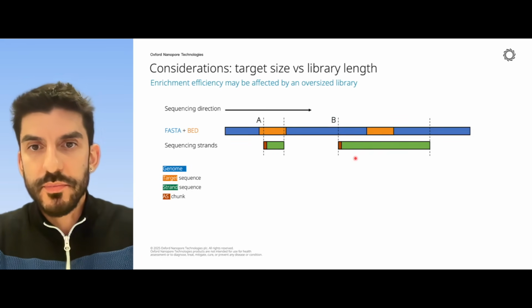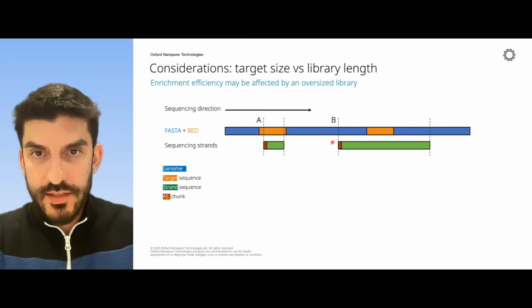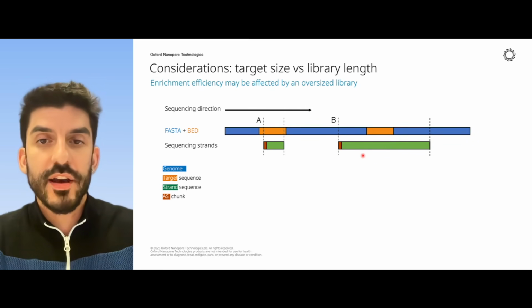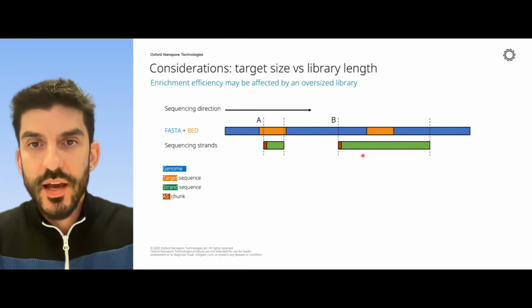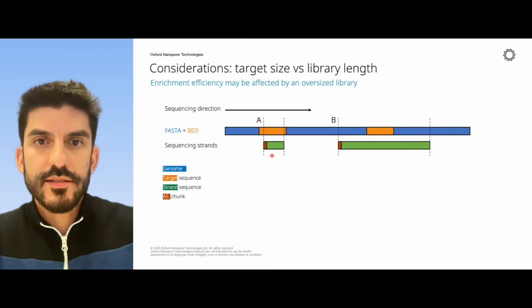Now, in situation B, we have a much longer strand, which, had it been accepted in the case of having ideal buffers in here, would have extended into our region of interest, and it would have provided us with a complete coverage of the region, a 1x coverage across our region of interest. However, this strand, for the sake of argument, takes approximately 10 seconds to get sequenced.